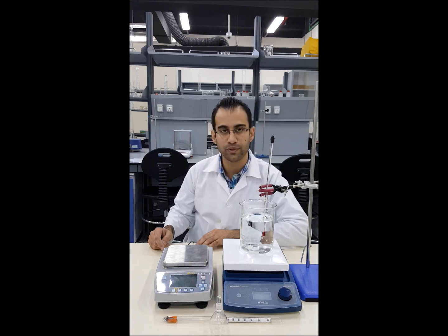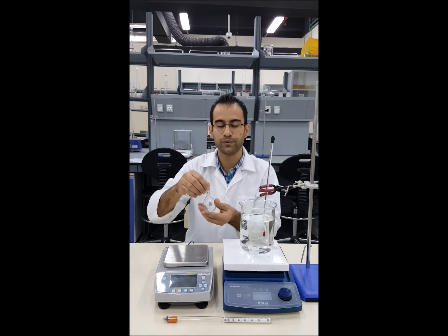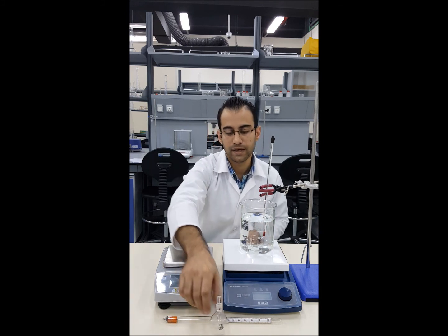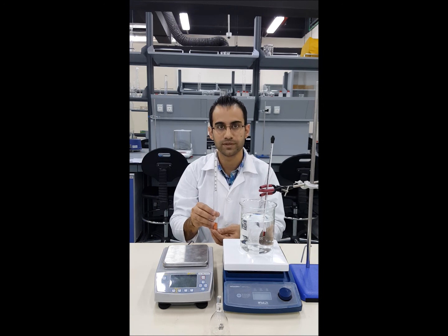We are going to use two methods to measure the density. The first method is using a density bottle — a 50 ml density bottle — and the second method is using a hydrometer with the proper scale.